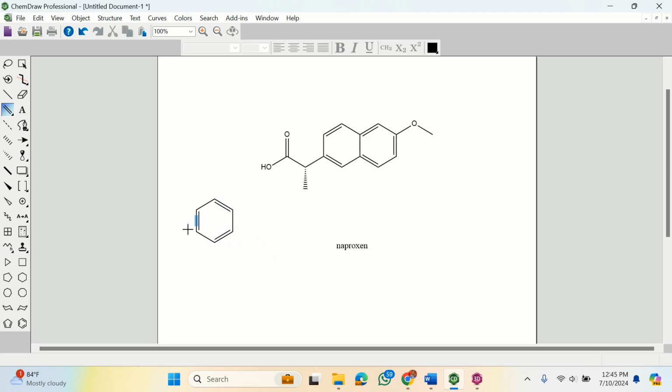All right. If you mistakenly put another one here, what do you think will happen? Look, there will be an error. The benzene may not be able to form because of that. You will notice it if you put something like this. You see the red, it is telling you that there can't be more than 4 bonds to a carbon. All right, so this is how you draw.